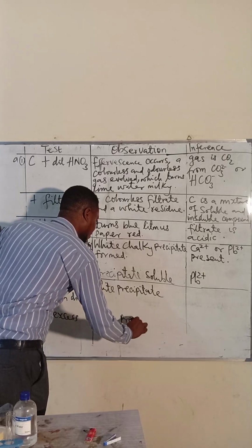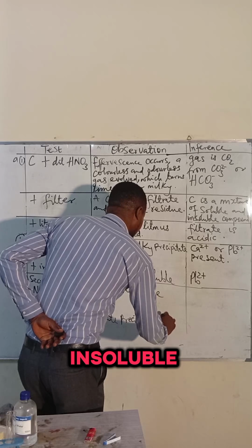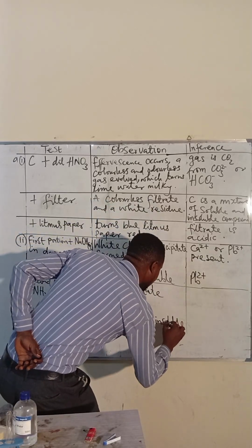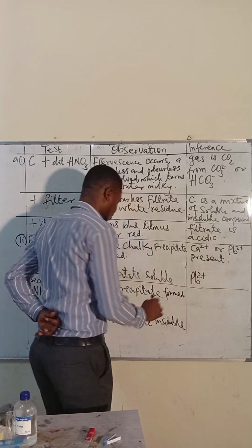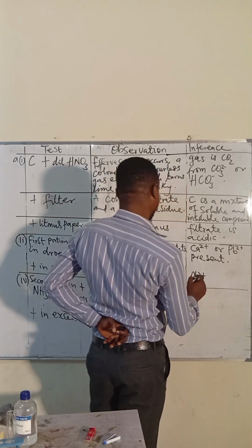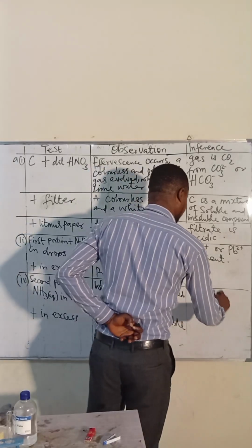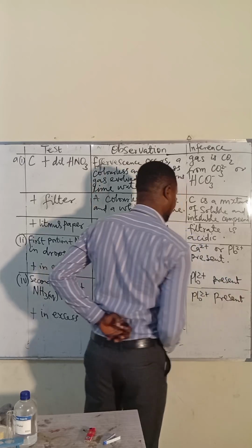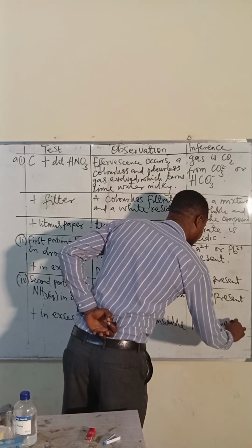White precipitate insoluble. Here we have lead 2 present.